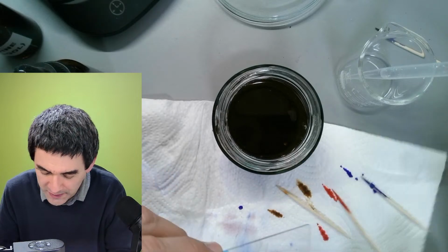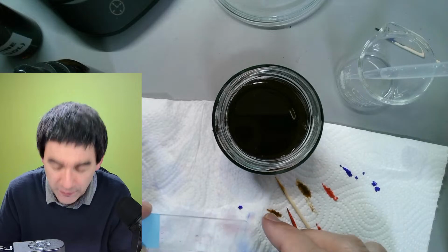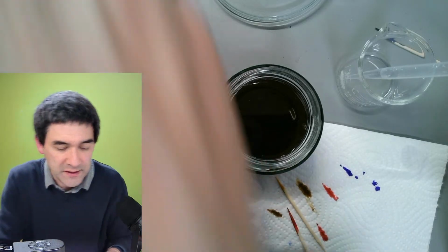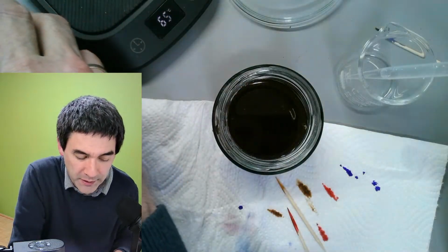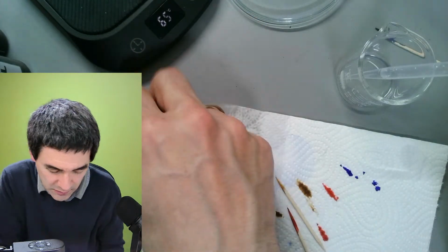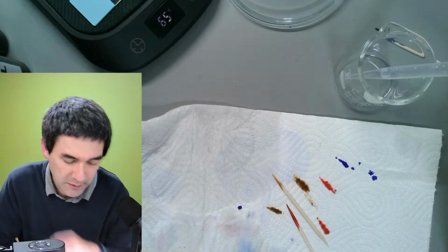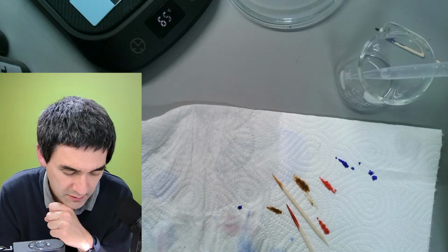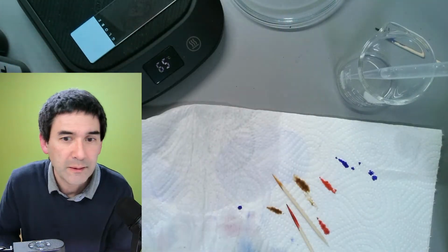And the hope, and again, this is a demonstration effect, is that we're able to see some gram-positive bacteria in my mouth, and that the body cells stained red. So I'm going to put it again here on the coffee warmer, and let's give it a minute or so.